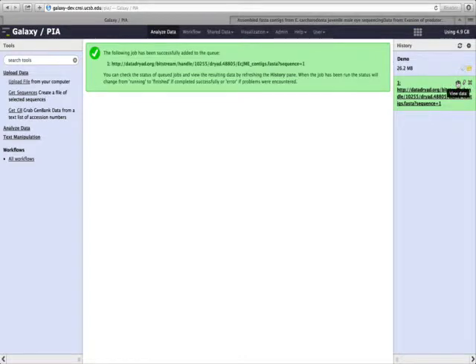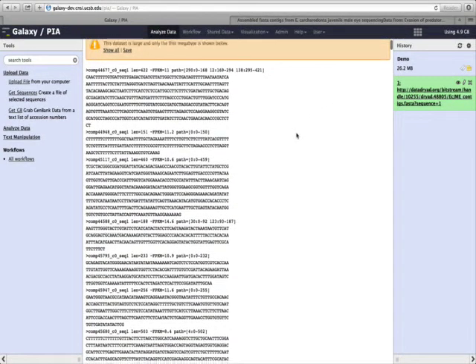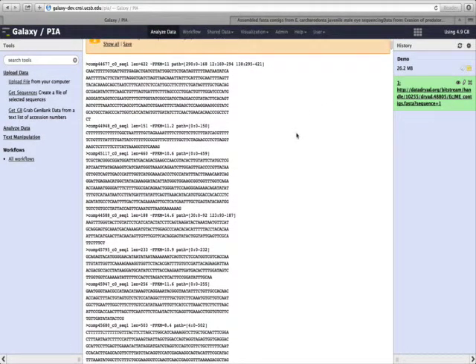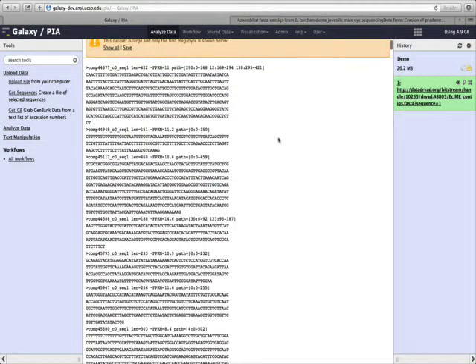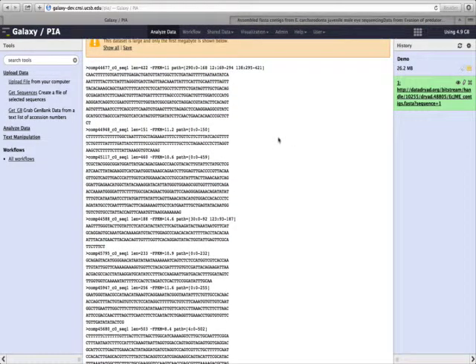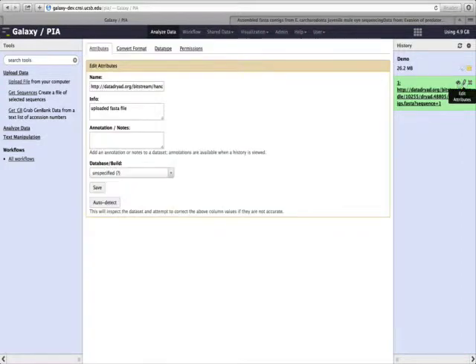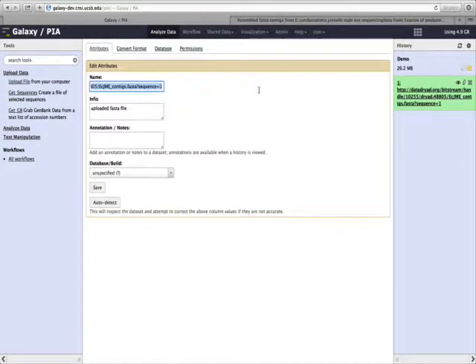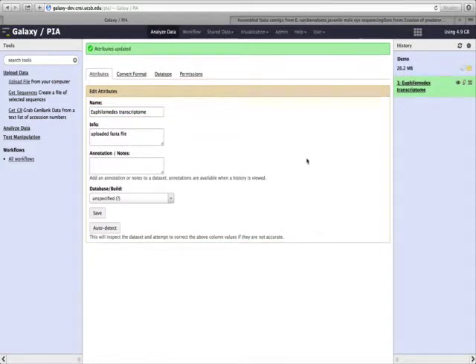So now we have downloaded the data from the Data Dryad Repository. We can click on the eye to see the data itself. You can see it's a set of FASTA files with DNA sequences. We can also click on this pencil or Edit Attributes icon to change the name of this file. I'll click here, and what I will call this is Euphilomedes transcriptome. Then I'll click Save, and you can see that in our history, the name is now changed.